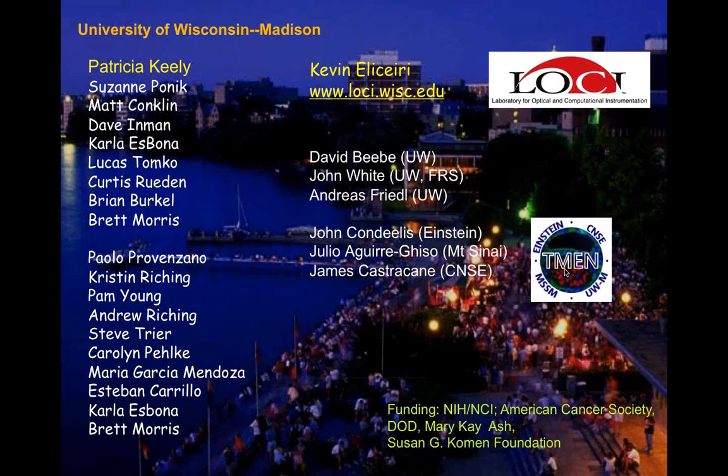That's a great question. I can speak to the point that it was written specifically for that context, but I can imagine it's relatively versatile. That's probably more of a question for the developers themselves. I do know that people use it for applications other than breast cancer, but I don't know if they have used it on features beyond second harmonic and collagen. But I'm sure that would be a good question for LOCI if you contact them. Okay.